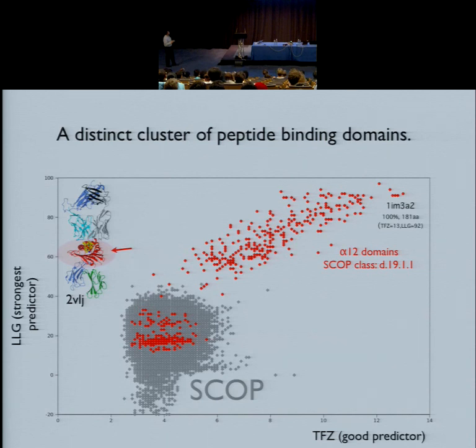About 50% of those remaining red dots are peptide binding domains which have lower scores. So the question right now is, we have two distinctive subsets of the peptide binding domains, but do the higher scores really represent the correctly placed domains?